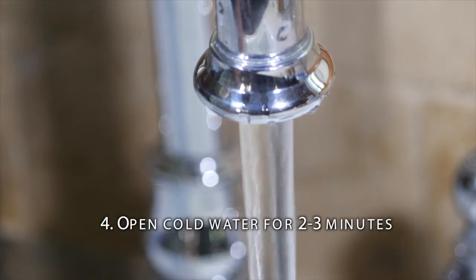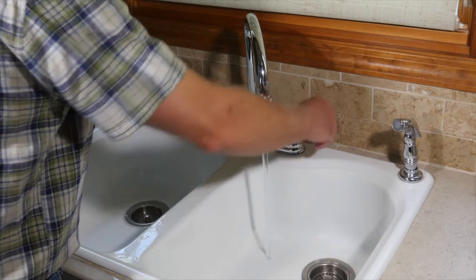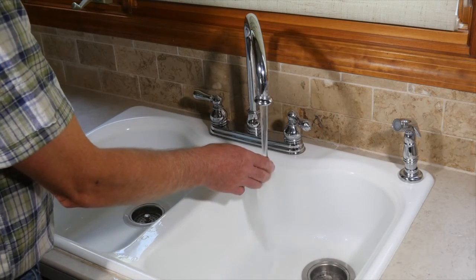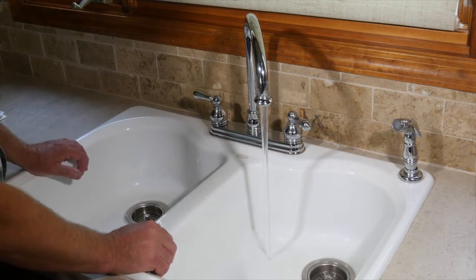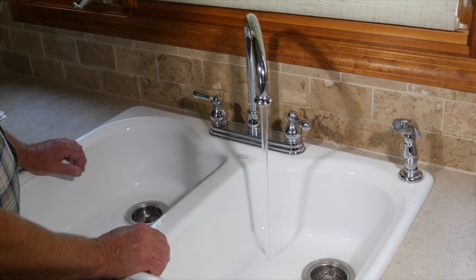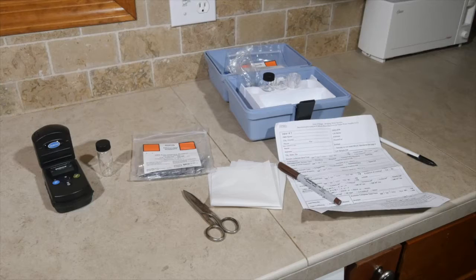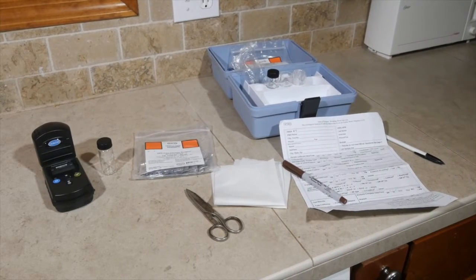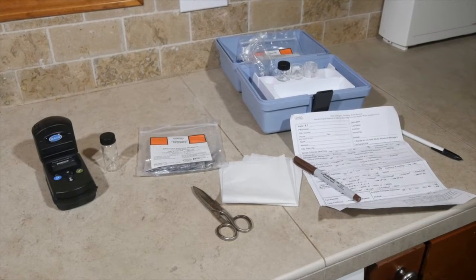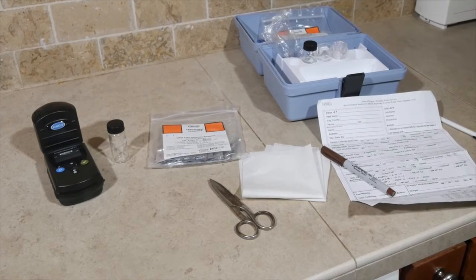Open the cold water tap for two to three minutes, or until water from the main reaches the tap. You can gauge this by when the water temperature stabilizes. Another good indicator is when you have the same chlorine residual at the tap as what you expect to find in the main. Now is a good time to take the chlorine residual sample. Do not take a coliform sample if you do not have a measurable chlorine residual.